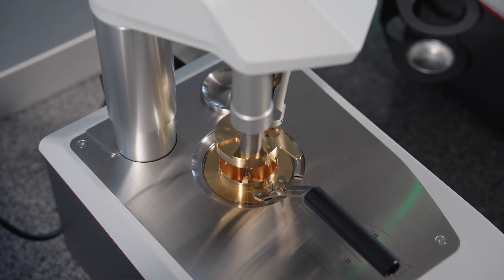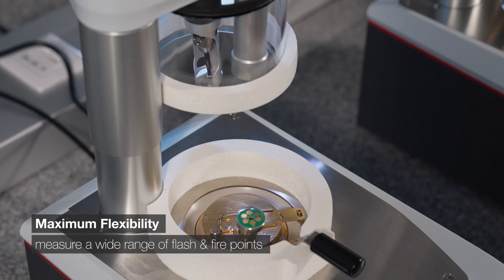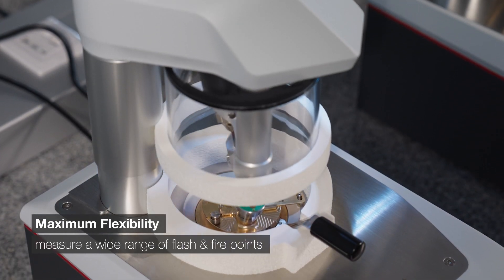They're flexible. You can measure a wide range of flash and fire points with open and closed cup methods.